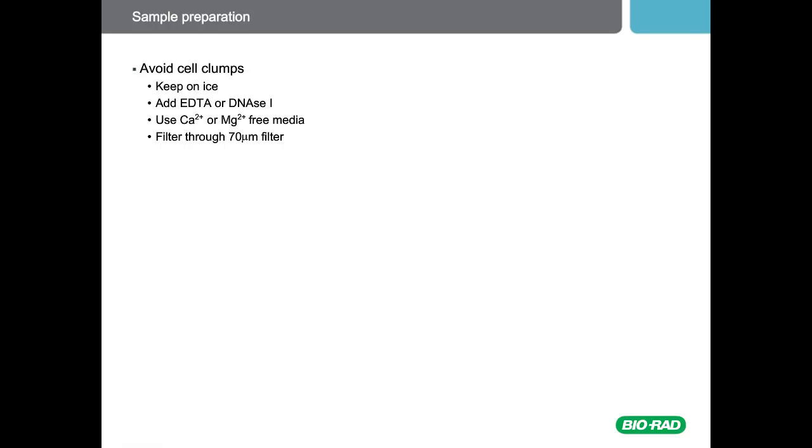When resuspending your cells, there are a few simple things that can be done to help prevent excessive cell death. Firstly, avoid vortexing, as this will damage fragile cells. Avoid excessive centrifugation and sediment at the lowest speed you can. Don't aspirate off all your media from your cell pellet, as cells will die in a dry pellet. Avoid creating bubbles as the surface tension may damage your cells.